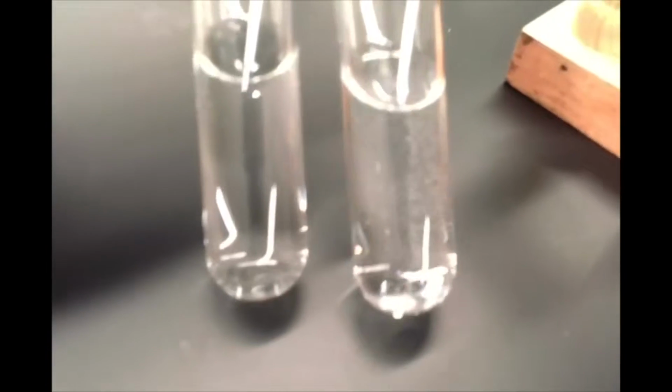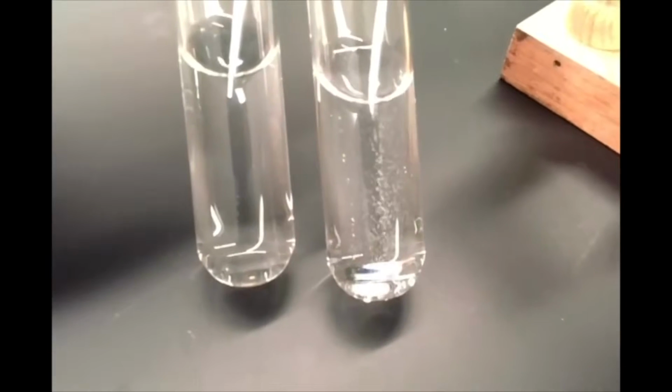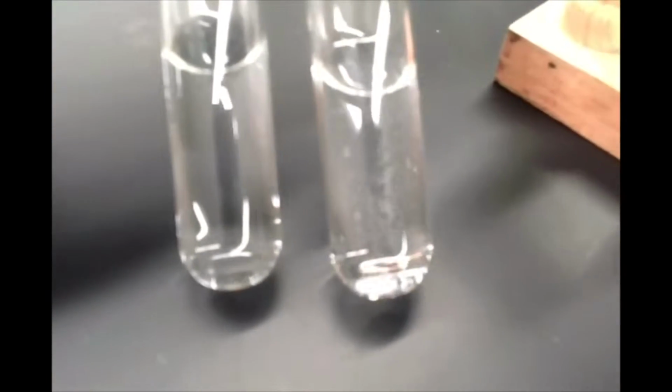Okay, so if you're having trouble seeing that, let's hold that against the dark background of our bench top here, and hopefully that'll be a little bit easier to see. Okay, so you can see our test tube on the right still has bubbles evolving, whereas our test tube on the left, which was in the hot water bath, cleared up much, much quicker.